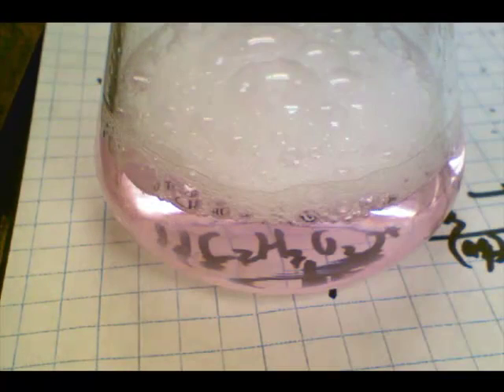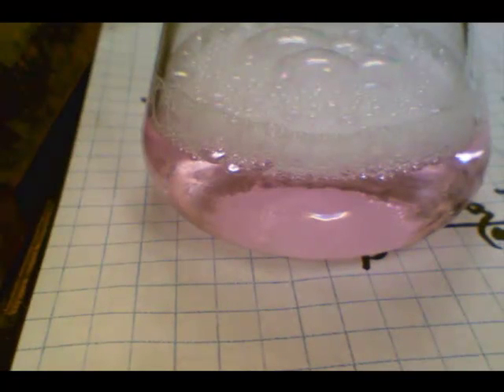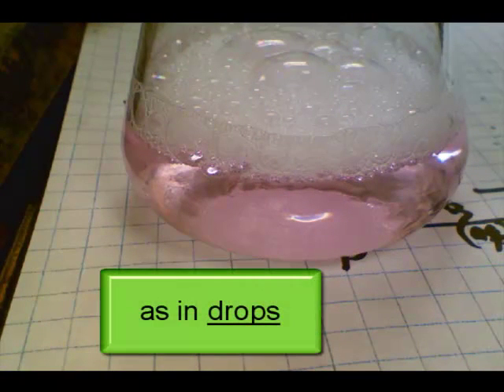Okay, I'm at the point now where I'm quite close to the endpoint. You can see that there's a slight pinkish tinge to the liquid, but it's not nearly as pink as it was when I started. I'm very close to the endpoint, and now I'm just going to add very small quantities at a time.